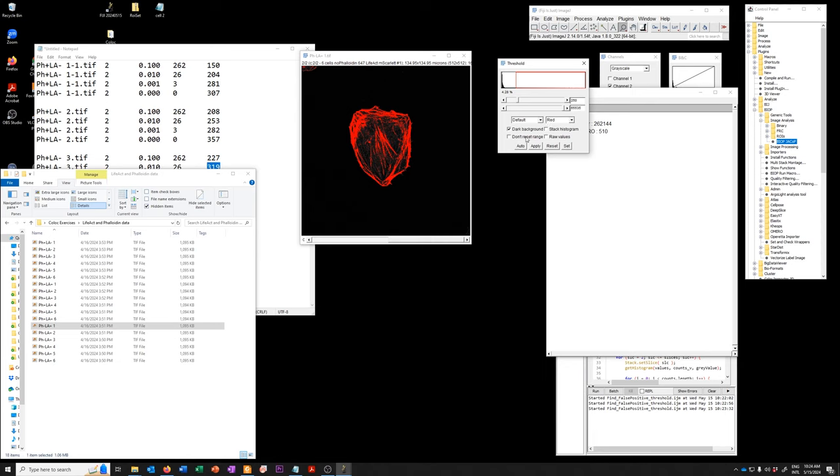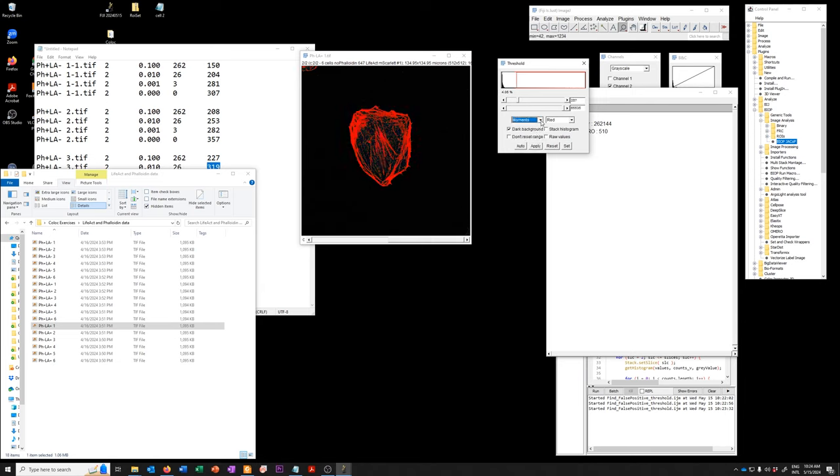And if we compare it to what it does with default, so default gives you a slightly lower one. Otsu gives you, let's see, actually, yeah, it gives you the same as the default.